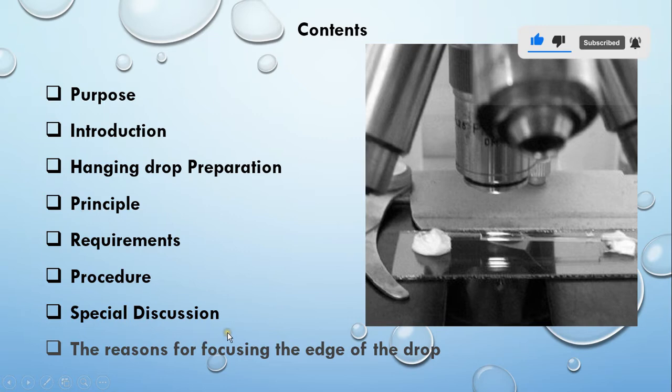Under special discussion, I am going to tell you about the reason for focusing the edge of the drop.